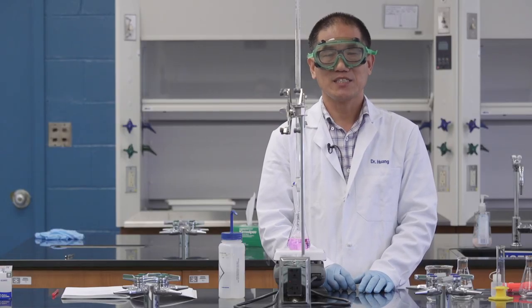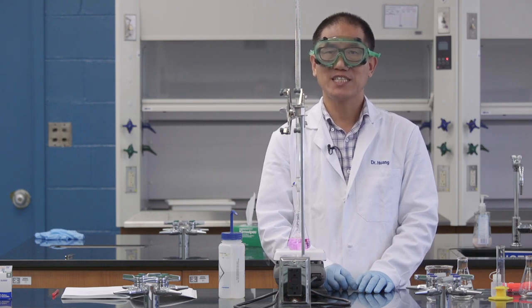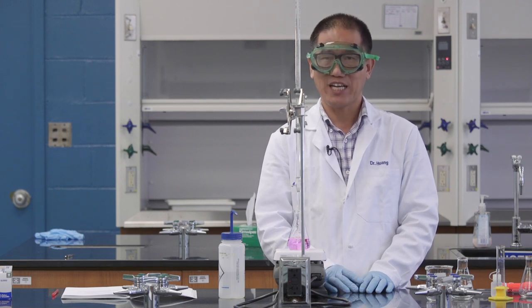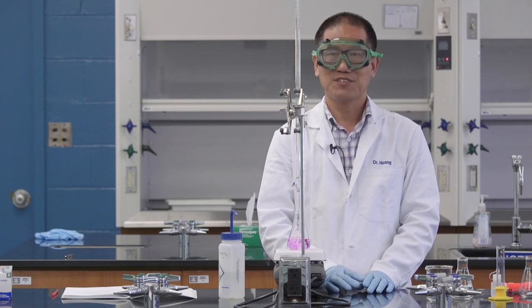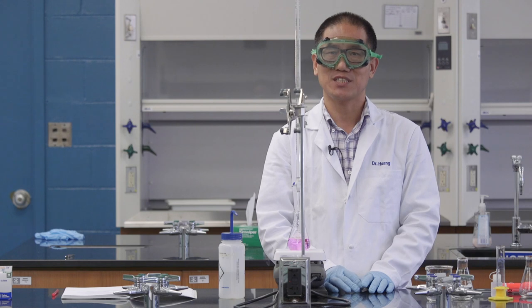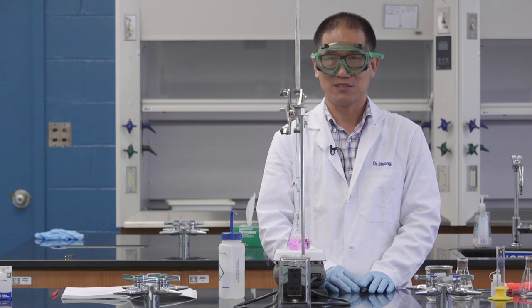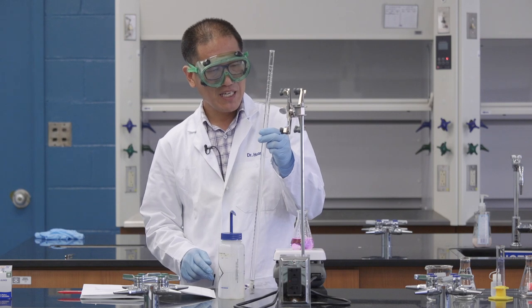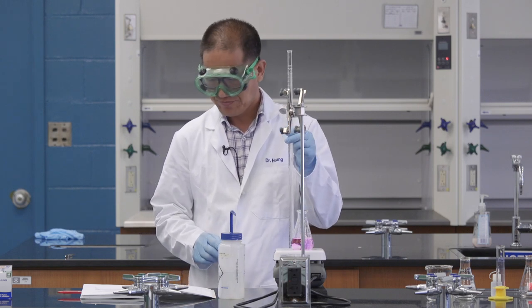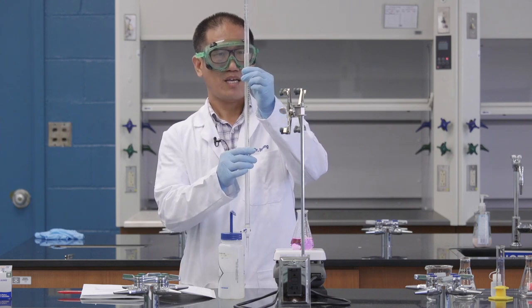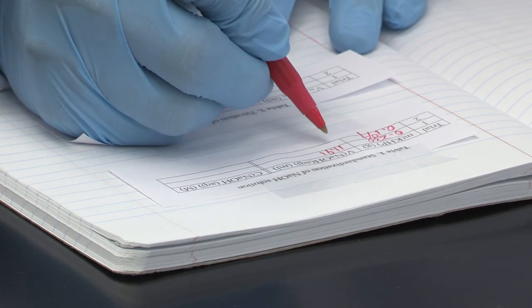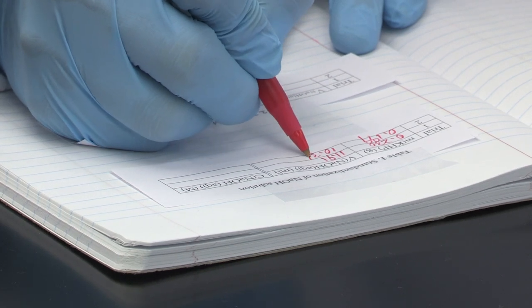Now, for any experiment, including titration, you have to make sure your experimental results is repeatable. In other words, between two trials, the percentage of difference between the two should be less than 0.5 percent for a professional person to do this titration. But, as for our class, if your percentage of difference between the two trials is less than 3 percent, I will take it. Let's see how many milliliters we use for the second time. This is 10.35 milliliters. We need to record the number immediately. It's 10.35 milliliters.